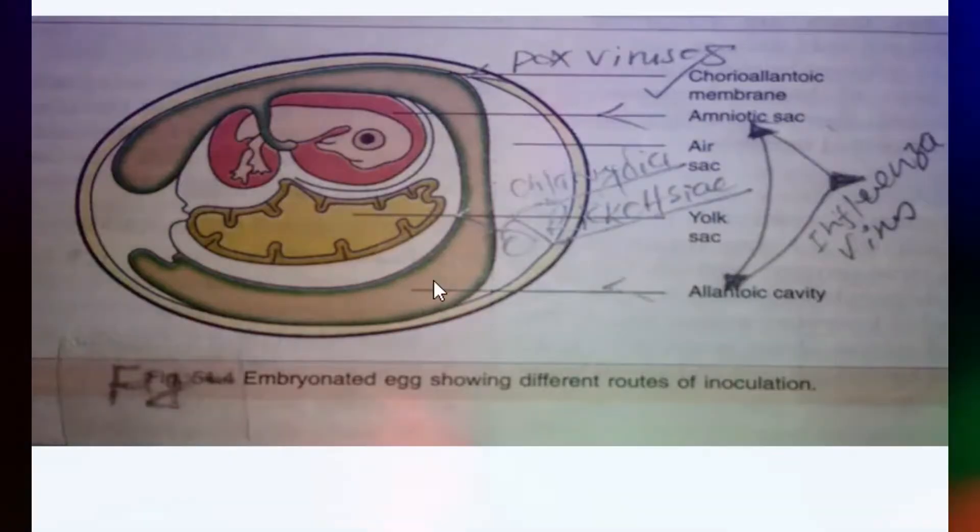In this region, that is allantoic cavity. Here you can see.